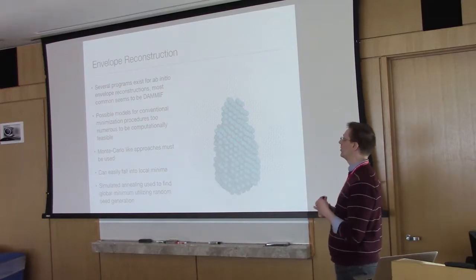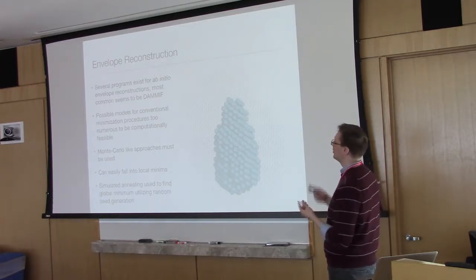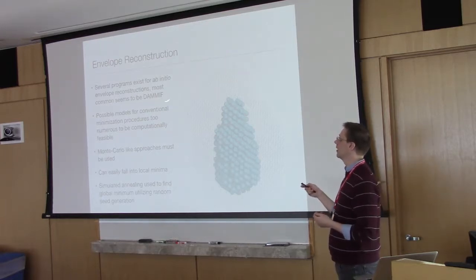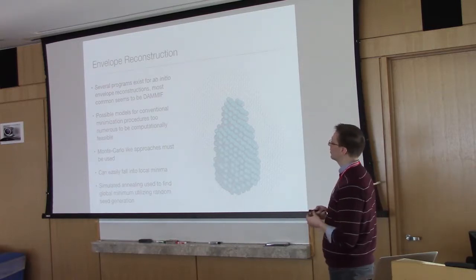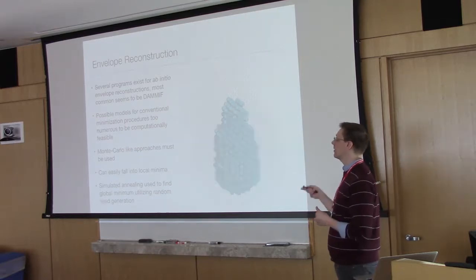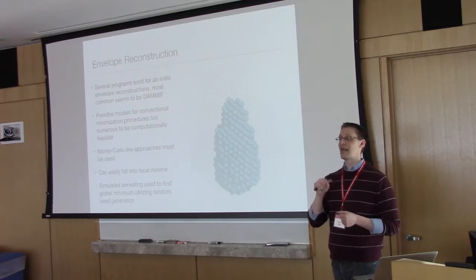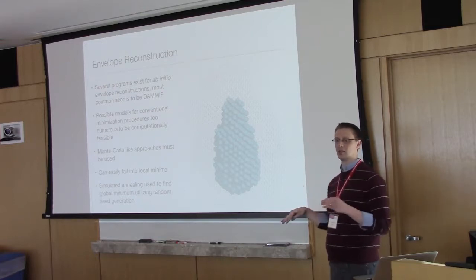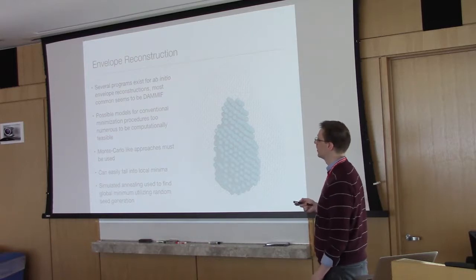When you're running GNOM, you'll get your pair distribution function, and then you'll save that as a GNOM file. And you use that for running the bead modeling programs like DAMMIF or GASBOR or DAMMIN. So it's really important to make sure that when you're doing that your fit to your scattering profile actually matches. You don't want to over smooth your pair distribution function because it affects your reconstructions.